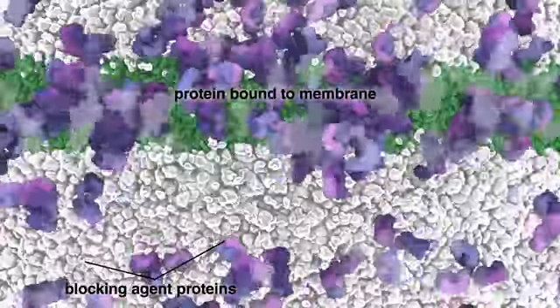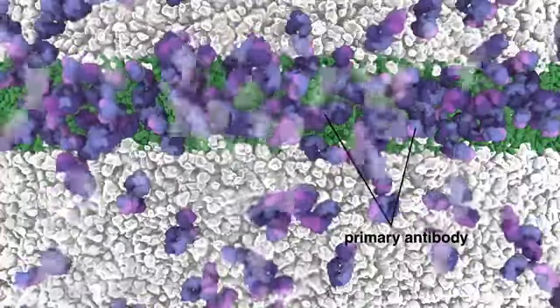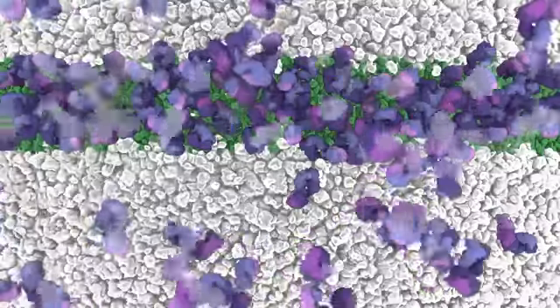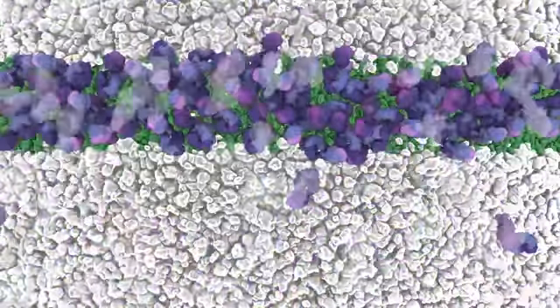After blocking, the membrane is then incubated in a solution containing blocking solution and the primary antibody that specifically recognizes the protein of interest. Incubation is then followed by a series of washes with washing buffer under mild agitation. Washing buffer contains the same mild detergent used in the blocking solution, which helps remove nonspecifically bound primary antibody.